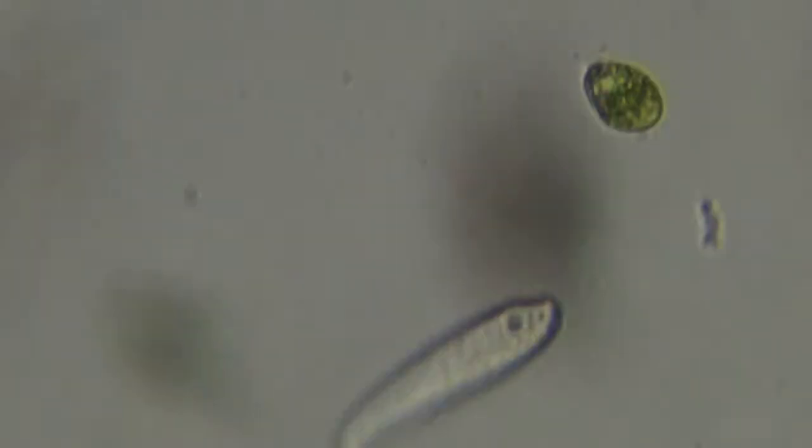And it's in and out, and it's so fast. It's like the hardest video game in the world to stay focused, stay centered, all at the same time. You guys are going to get dizzy watching this, so let me go out a level. Change it to dark field, and see if I can track him now.